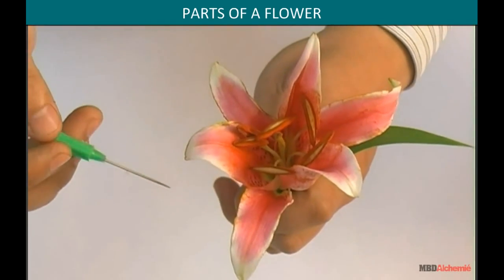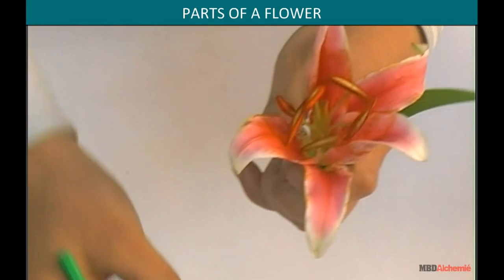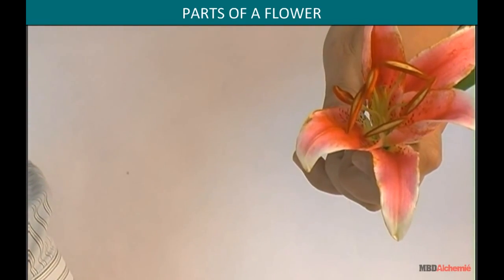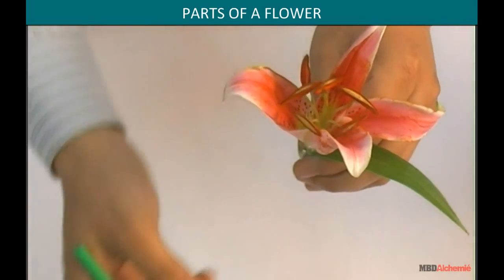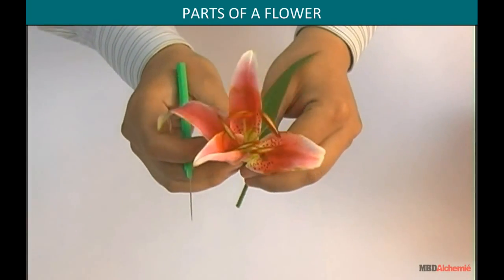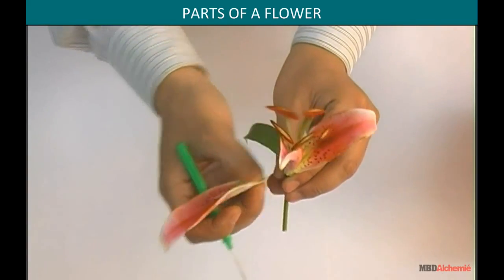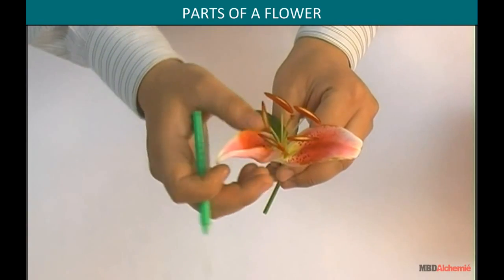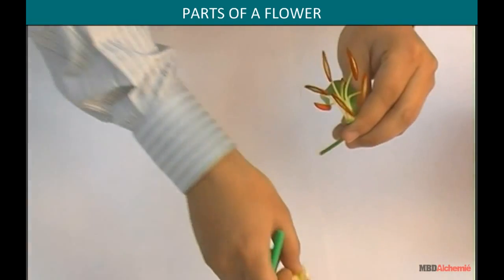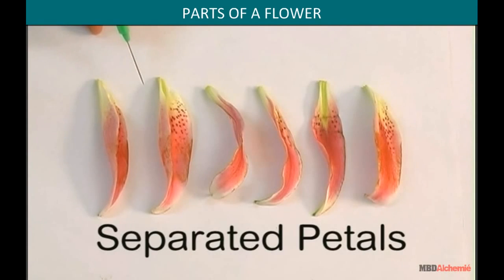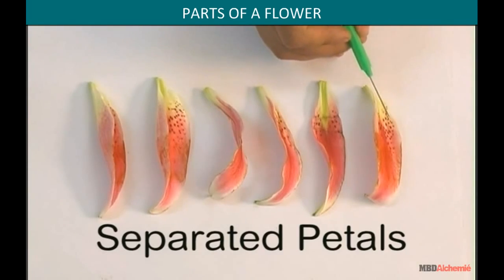Let us start the dissection by removing each of these petals — the first one, second, third, fourth, fifth, and the sixth. Here are the separated petals: first, second, third, fourth, fifth, and sixth.